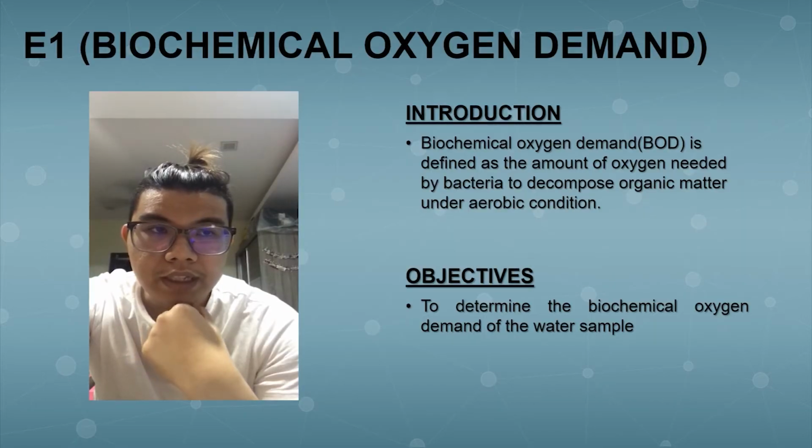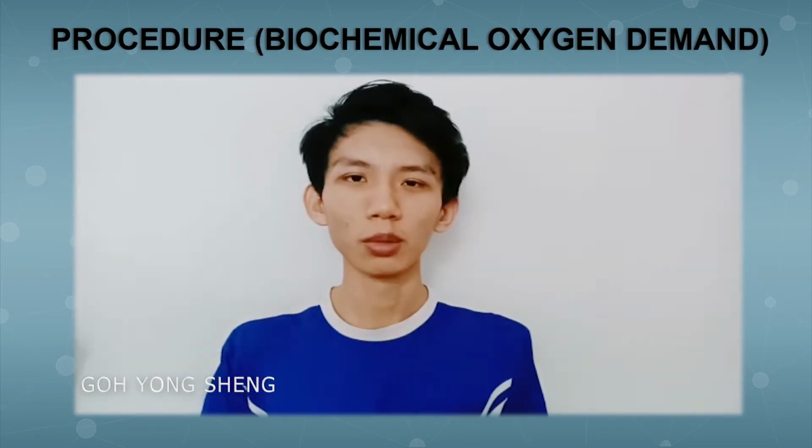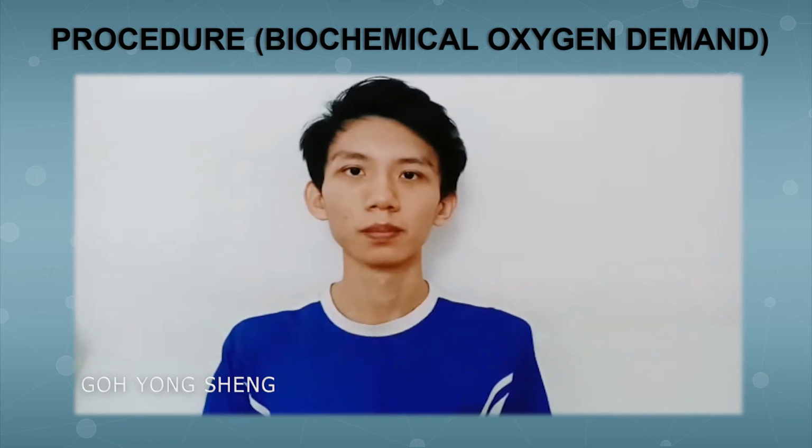Introduction for BOD test. Biochemical oxygen demand is defined as the amount of oxygen needed by bacteria to decompose organic matter under aerobic condition. And the objective of this test is to determine the BOD of a water sample. I am Go, and I will continue to present about the procedure of BOD test.